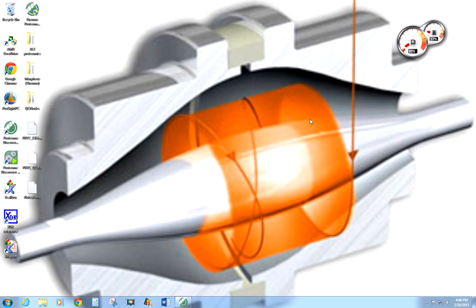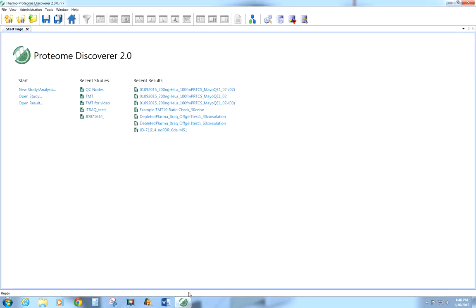Hey guys, this is Ben Osborne with Thermo Scientific, and in this video we're going to look at all the options in the administration menu in Proteome Discoverer 2.0.